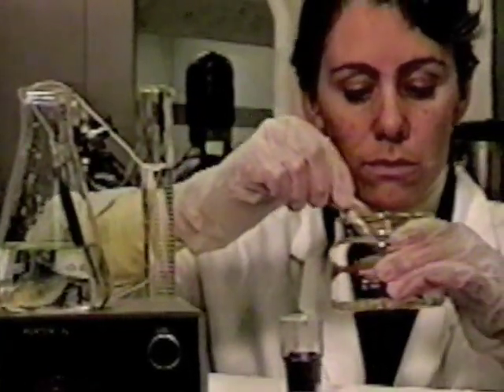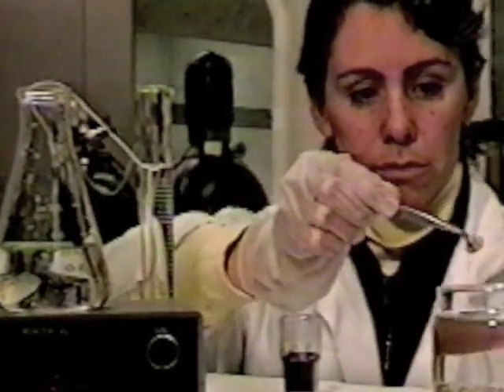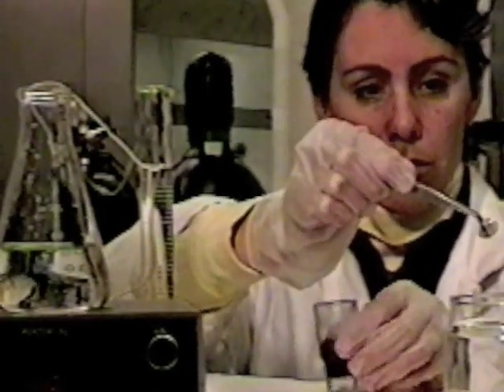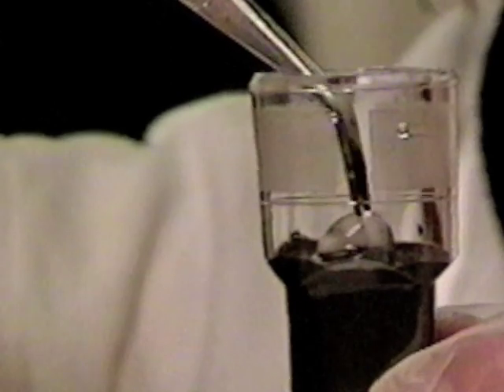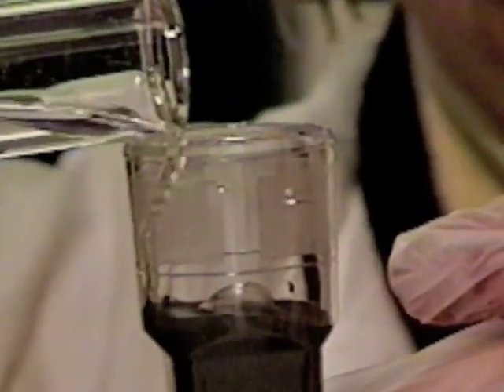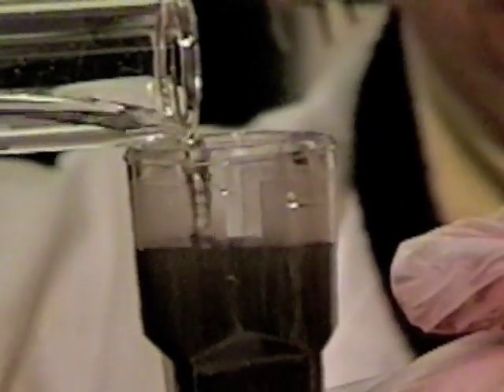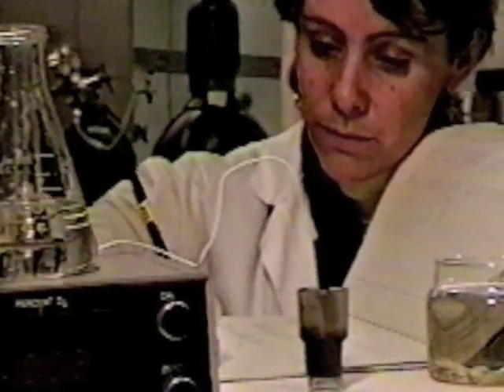In one of my experiments, I contaminated some natural sediment with radioactive metal. I incubated it for about 3 weeks so that it exchanged properly with all the different parts of the sediment. And then I placed clams into that sediment for a short amount of time, and I looked at how much of the metal associated with the sediment was passively taken up by the organism just by being in the sediment. I found that much of the metal that they get into their bodies is mostly from overlying water, and probably very little contaminants are taken up passively into their tissue from the sediment itself.